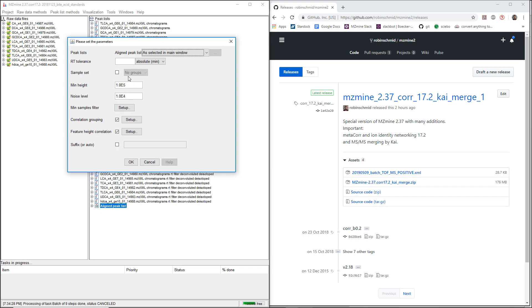The basic function is that we want to find multiple rows in a feature list or aligned feature list that correspond to the same feature or the same molecule. All these ions were generated by the same molecule eluting from the column, and this module is going to group them.